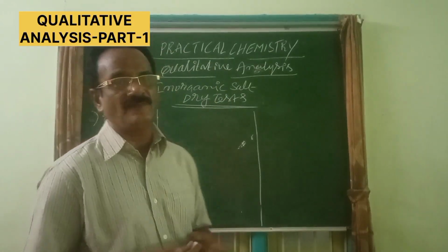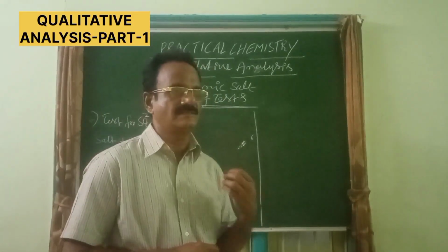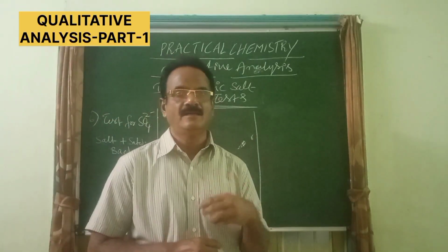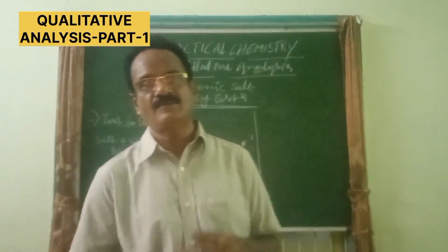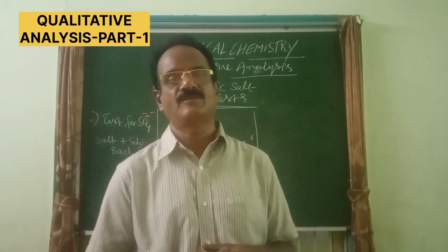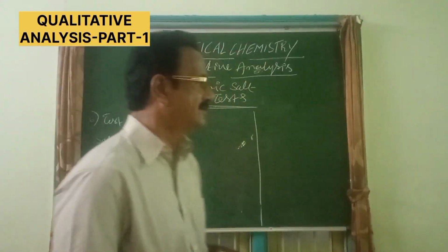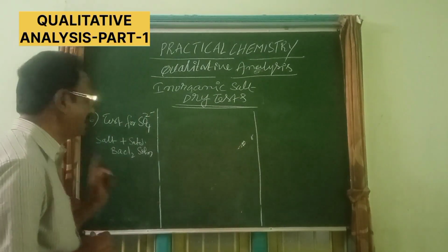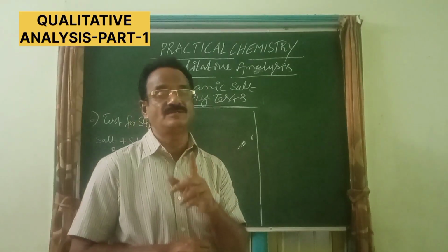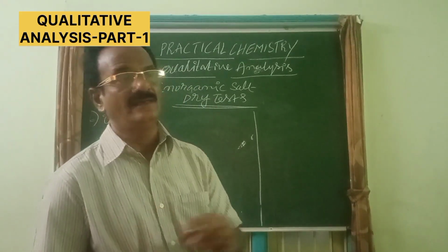So when some barium chloride remains undissolved at the bottom of the solution, such a solution is said to be saturated barium chloride solution. The supernatant of that solution is to be added, keep in mind.